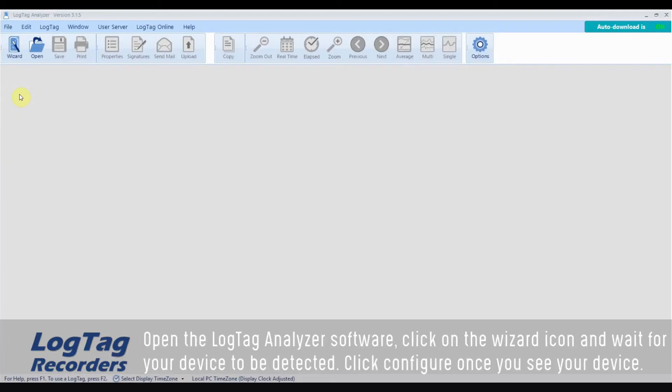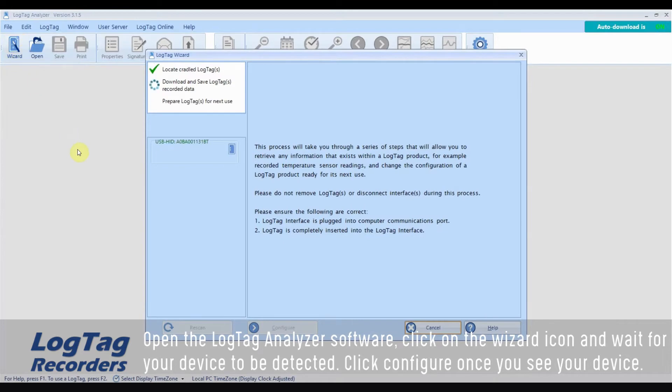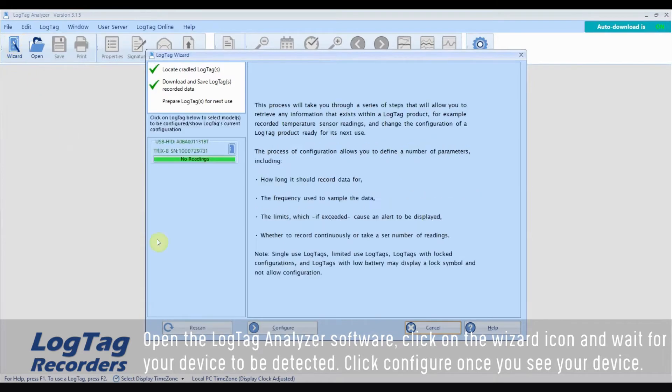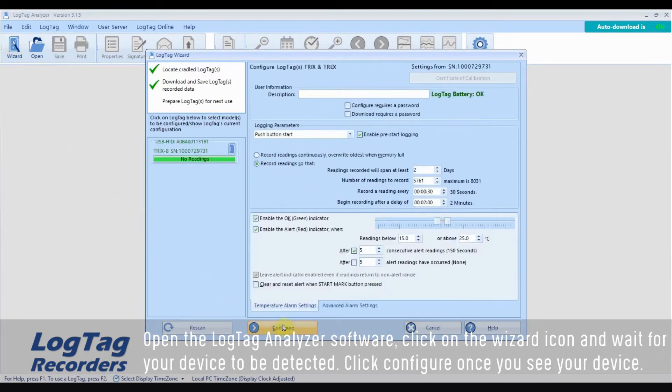Open the LogTag analyzer software, click on the wizard icon and wait for your device to be detected. Click configure once you see your device.